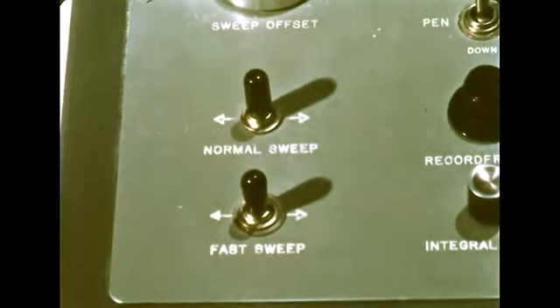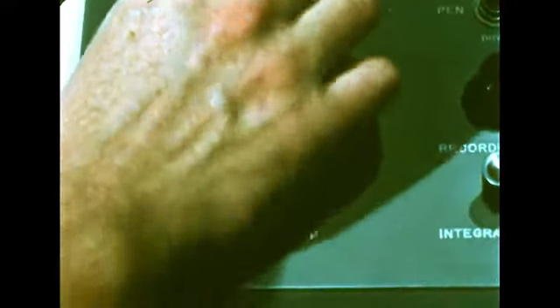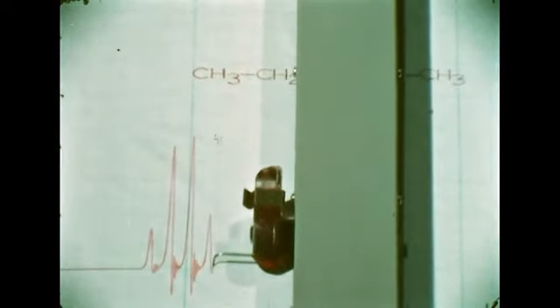The time for the scan is then chosen. For weak signals, a slow sweep is desirable. Now we are ready to record the spectrum. Here we see the spectrum of diethyl ether, with its now familiar quartet, caused by the methylene protons split by the 3 neighboring methyl protons, and the methyl protons split into a triplet by the 2 neighboring methylene protons.